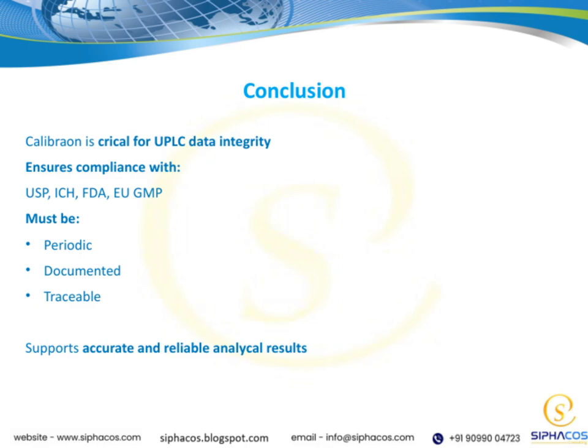And of course, all calibration activities should be thoroughly documented and easily traceable, so we have a clear record of compliance and quality assurance. By adhering to these principles, we support the generation of precise data, which ultimately underpins trustworthy analytical results. This, in turn, ensures that our products meet the highest standards and regulatory expectations.